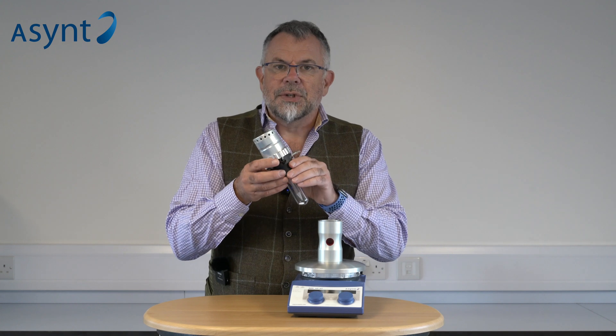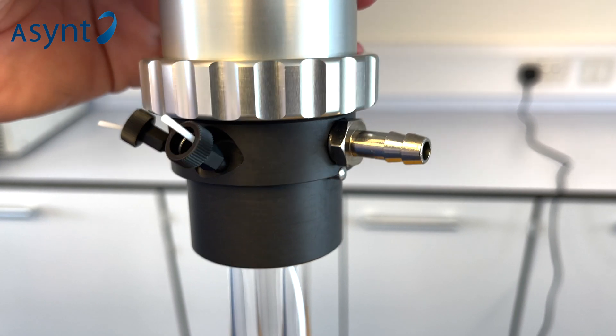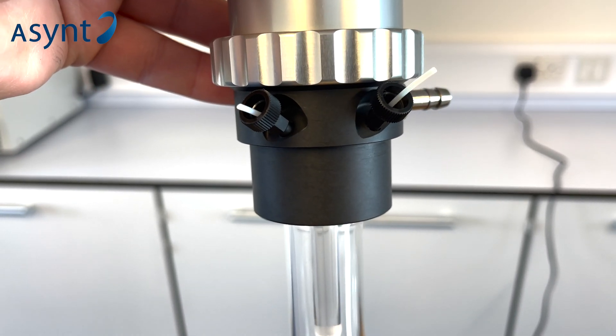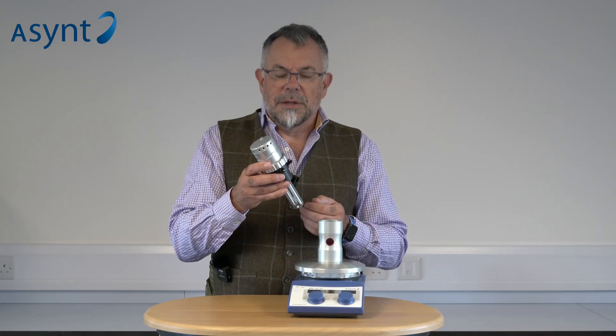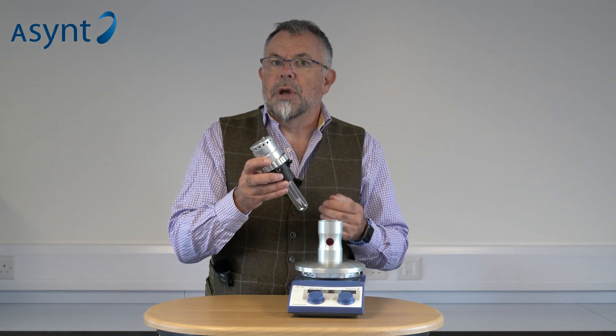We have a gas-tight seal in here and inert atmosphere control from the side. We also have two ports that you can optionally use as you wish. For instance, one could be used to make additions, and the other with a dip tube could be used to take samples during operation.